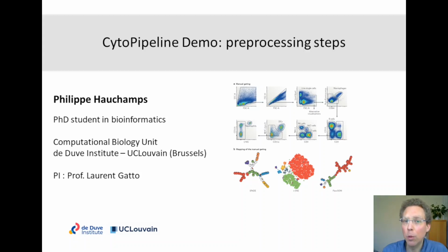Hi everyone, and welcome to this series of short videos devoted to CytoPipeline, another tool for building and visualizing pre-processing pipelines for flow cytometry data. In this video, I will provide a bit of background information about pre-processing steps and what it means to automate these pre-processing steps. In particular, I will also try to provide a set of typical examples and how to automate them. If you are already familiar with pre-processing pipelines in R, you might want to skip this video and jump immediately to the other ones. If not, let's get started.